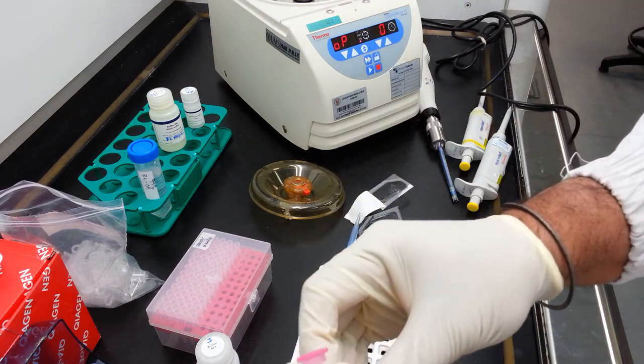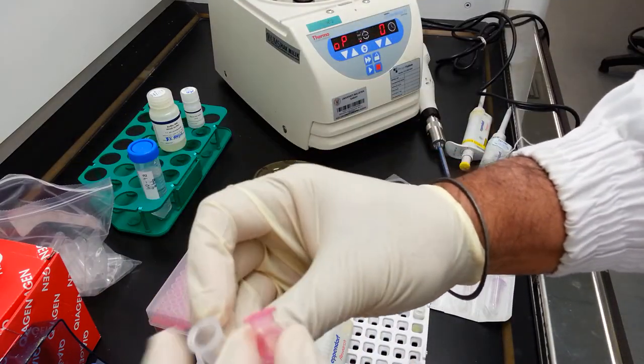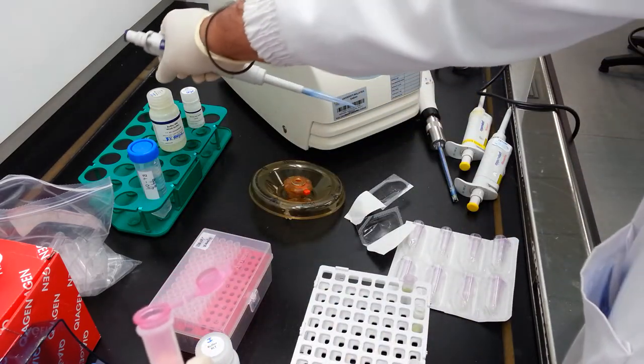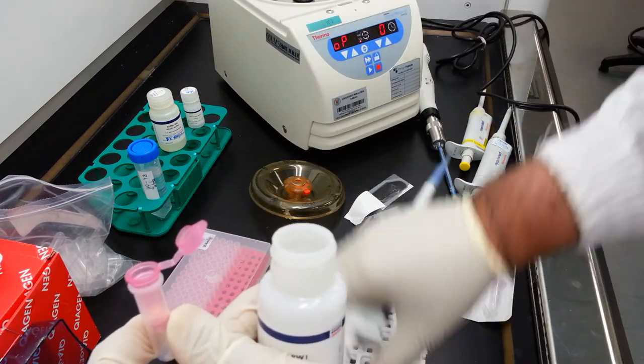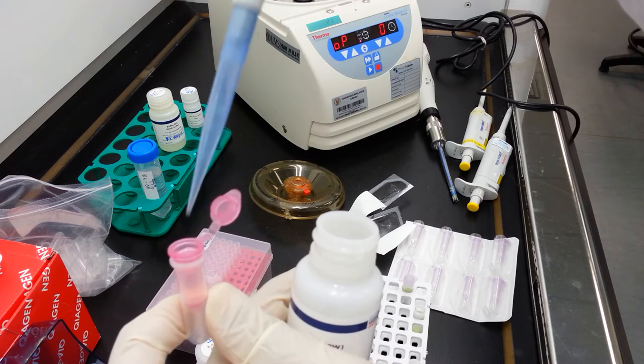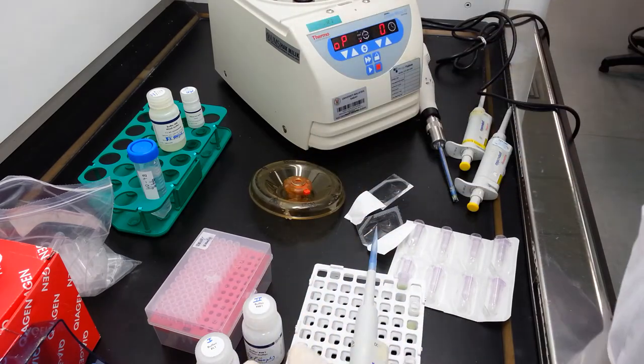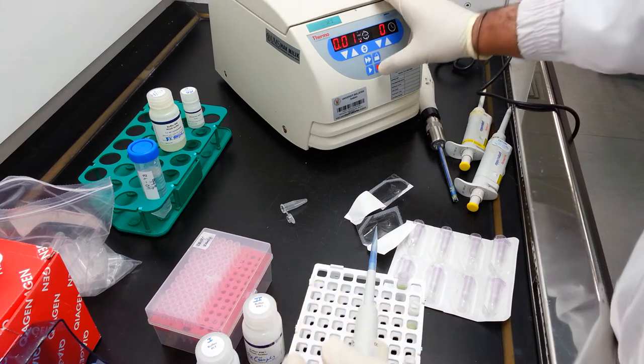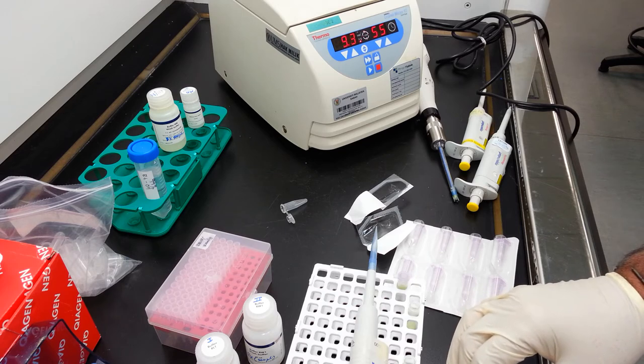Repeat this procedure one more time. Here you have a fresh collection tube. Insert the tube containing your RNA sample into the collection tube. Add 500 microliters of buffer RW1 into the upper section. Spin this again for 15 seconds at 13,000 G.